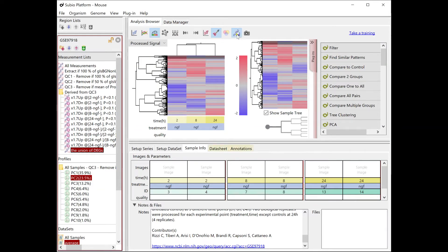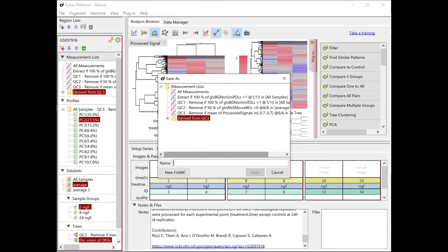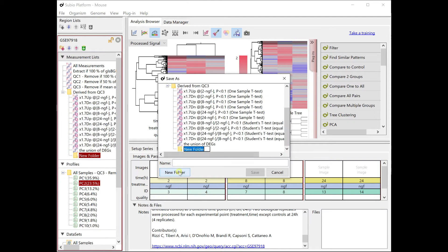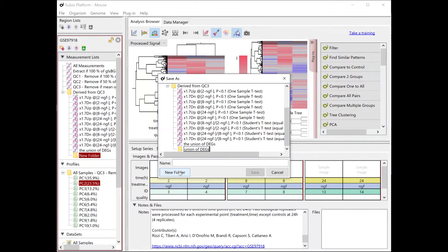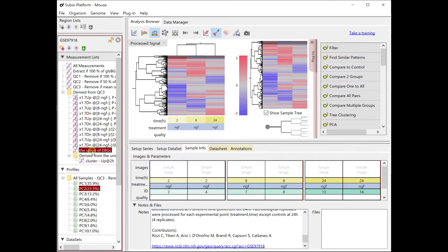You can save any nodes, or clusters, as measurement lists. Do it repeatedly to extract genes in the clusters of interest.